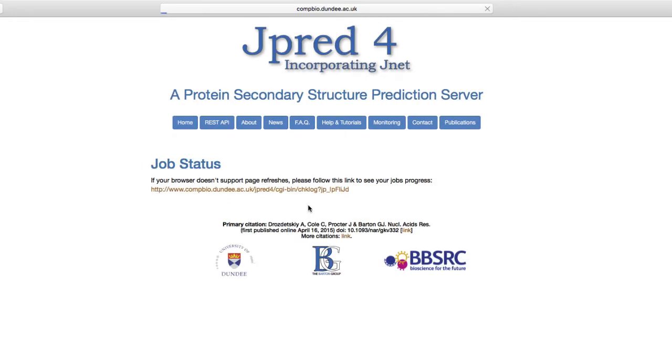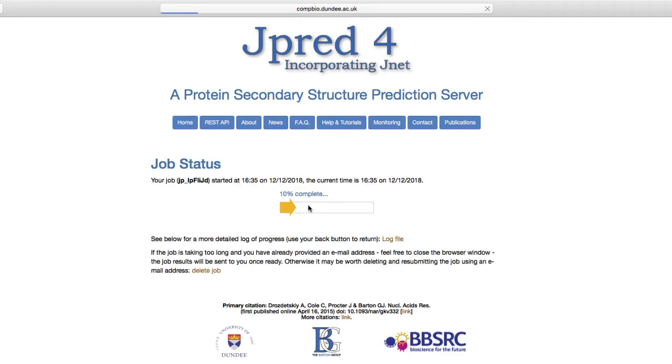JPRED takes the sequence and constructs a multiple alignment using the PSI-BLAST algorithm with three iterations. Redundant sequences are removed along with any gaps that have appeared in the sequence query, after which the prediction algorithm runs.